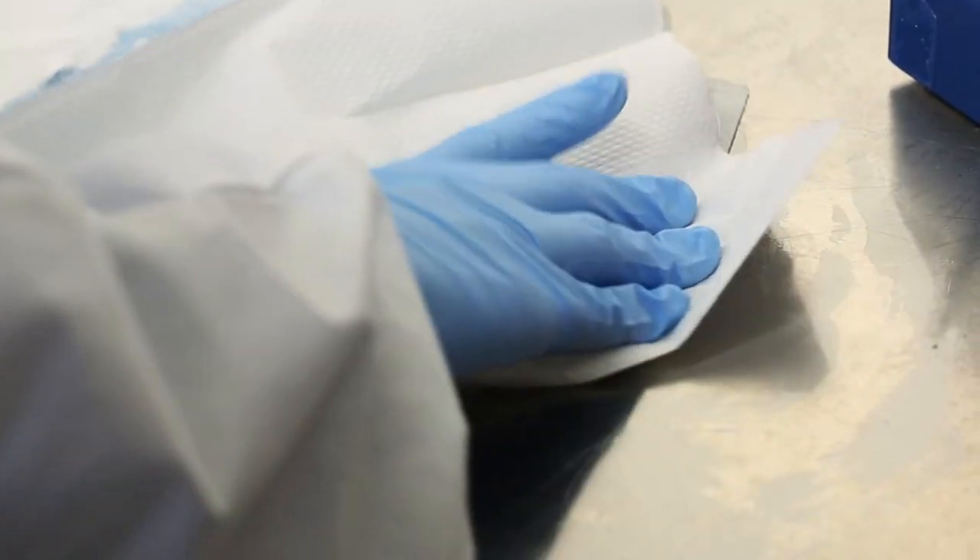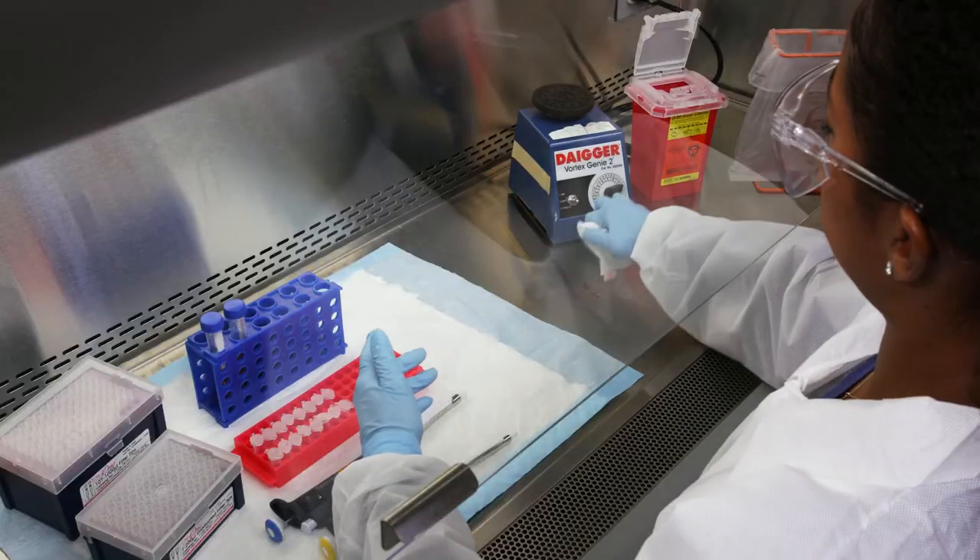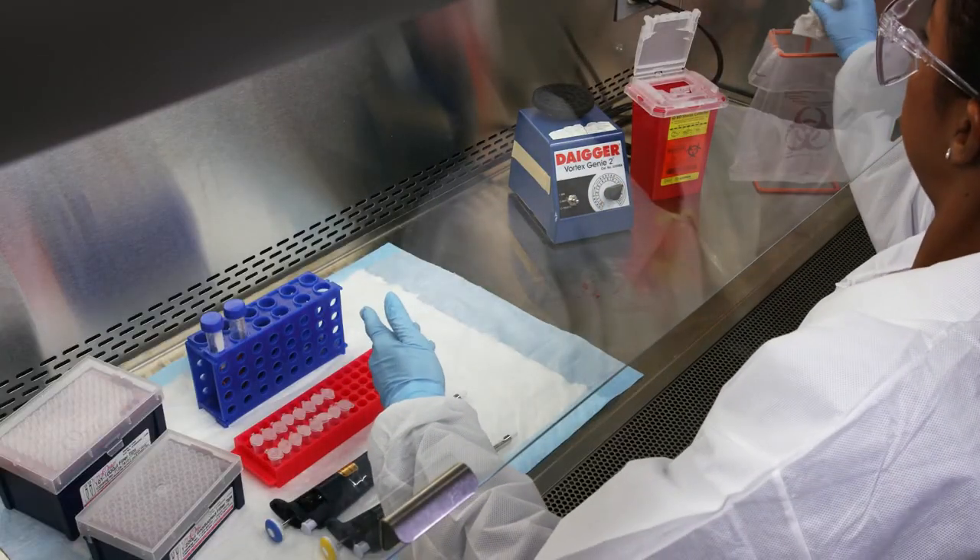Wipe up as much of the spill as possible, and discard the towels in the biohazardous waste container.